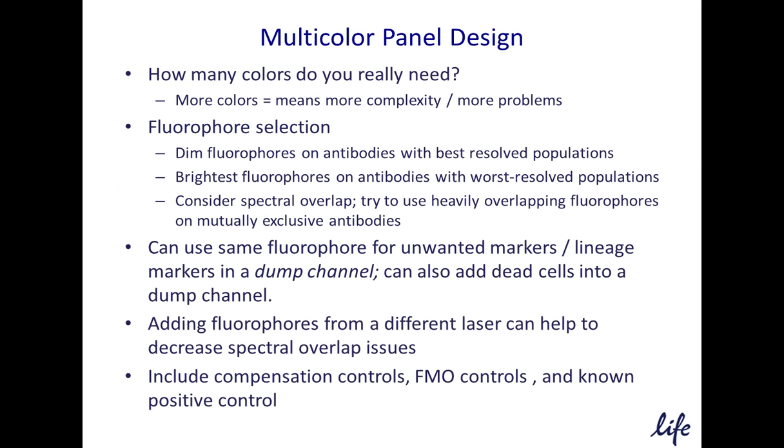So in panel design, there are several things to think about. How many colors do you really need? More colors means more complexity and more problems. Fluorophore selection: put dim fluorophores on antibodies with the best resolved populations, brightest fluorophores on antibodies with the worst resolved populations, and consider spectral overlap.